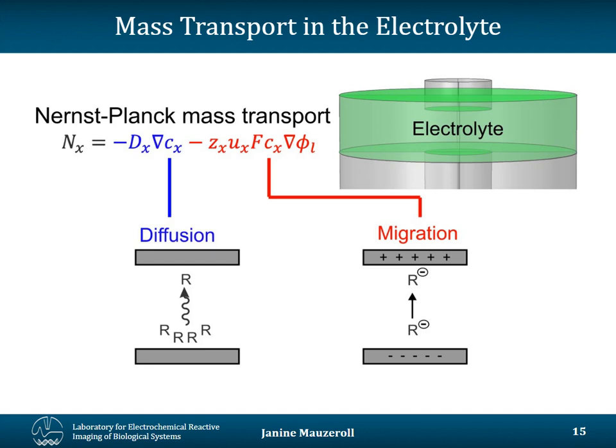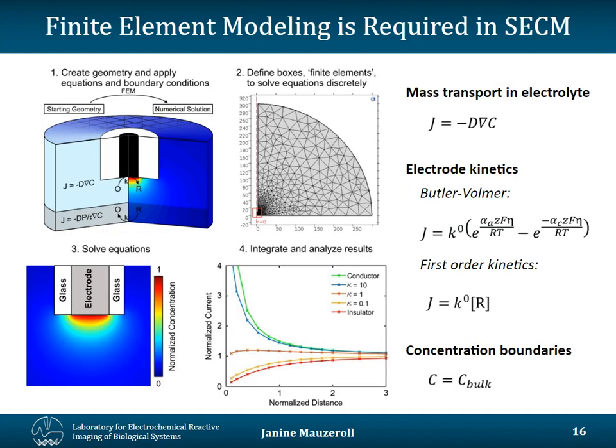So in order to have a quantitative understanding of the current, we need to combine these expressions related to the electrokinetics and related to the mass transport in the electrolyte. And the tool that many people use is based on finite element modeling. So in panel 1 on the top left-hand side, I'm showing you a typical geometry that we use to start off our simulations.